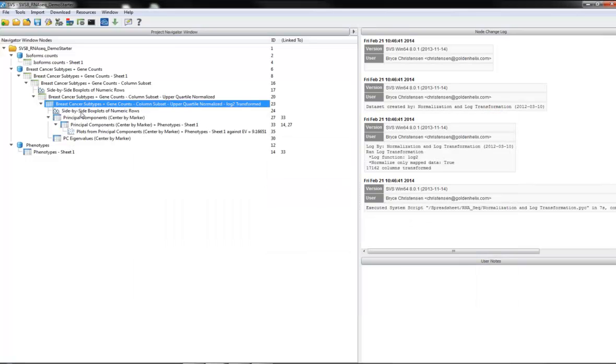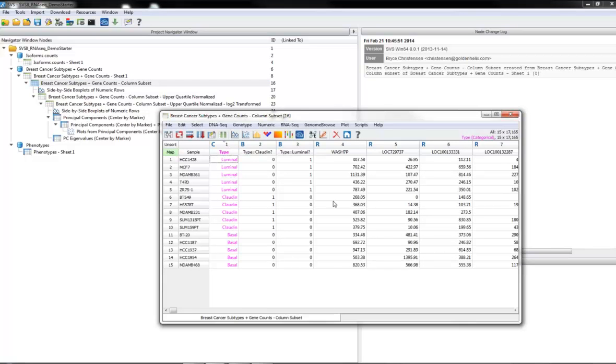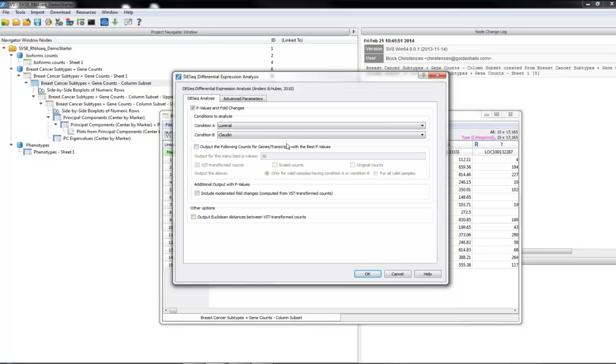So now if I want to run an association test, I could use that same normalized transformed data as the basis for an association test using, again, the t-test or regression or ANOVA type tools. But what I'd like to do here is come back to the data prior to the normalization being applied and use the DE-seq method. DE-seq is a bit more sophisticated method for association with RNA-seq.